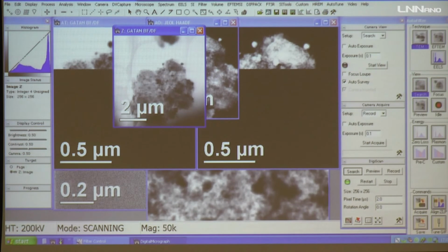You see, I am in the bright field detector that is aligned with the optical axis, and I will change the position of this direct beam around this central bright field detector that's in the center of the projection.